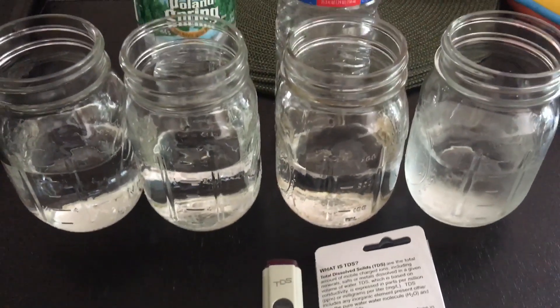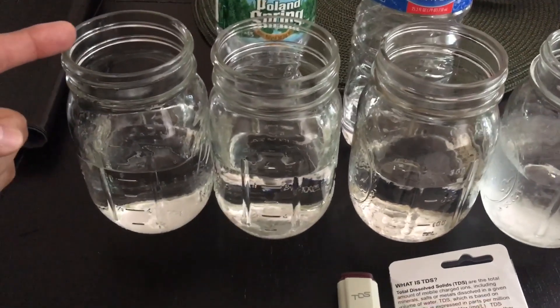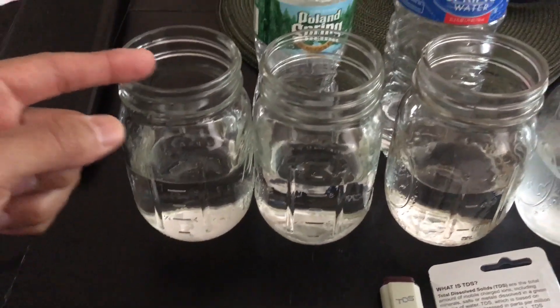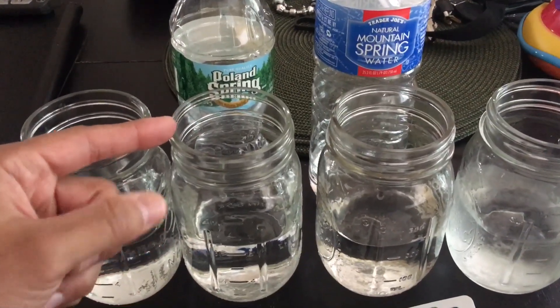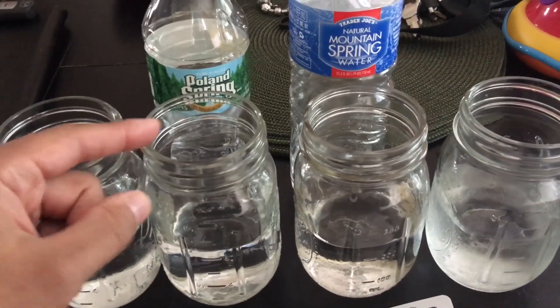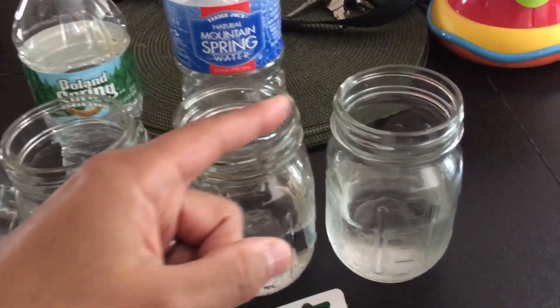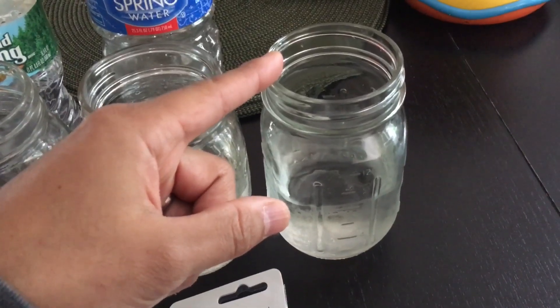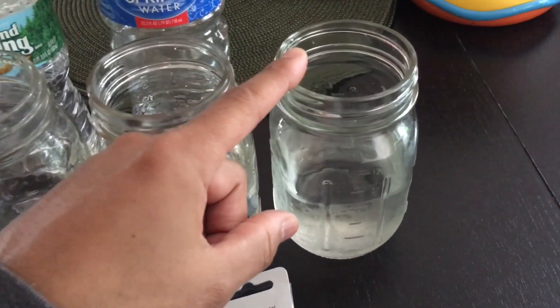In front of me I grabbed four samples of water. The one on the far left is actual tap water from my municipality. Second to that, I have Poland Spring water I had a bottle of lying around. We also have Trader Joe's natural mountain spring water. And last but not least, we have baby water — a purified water with fluoride for our son.